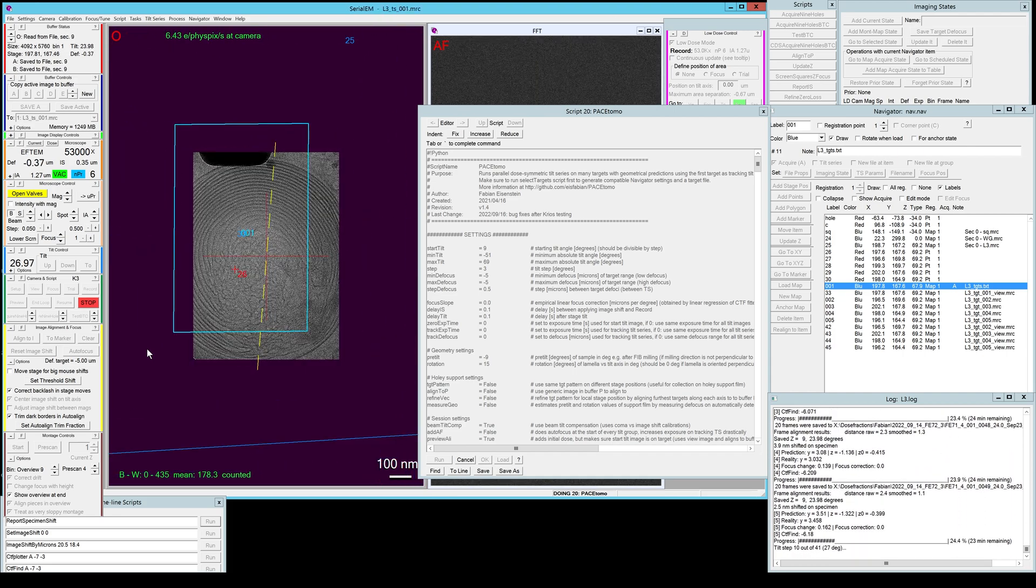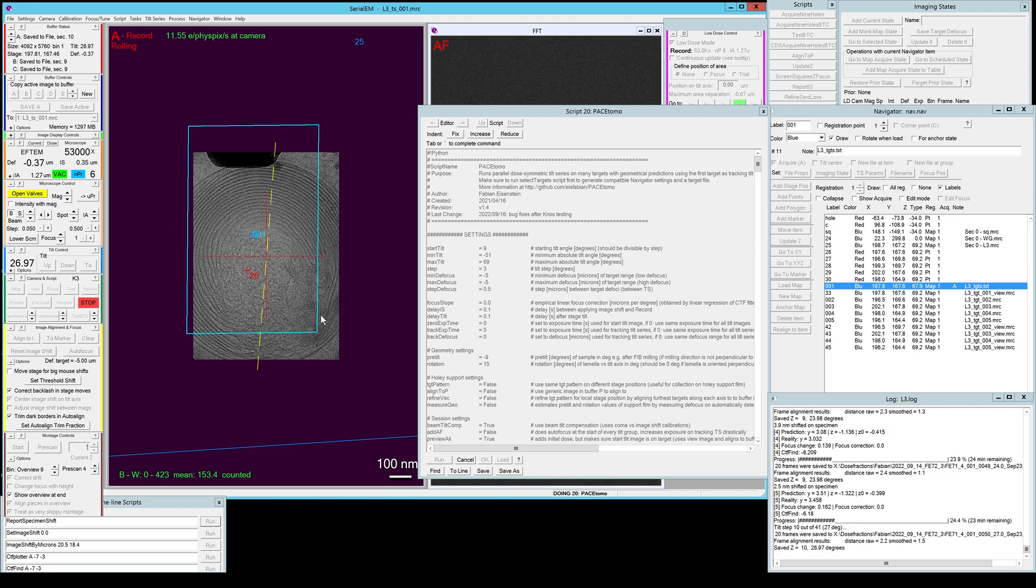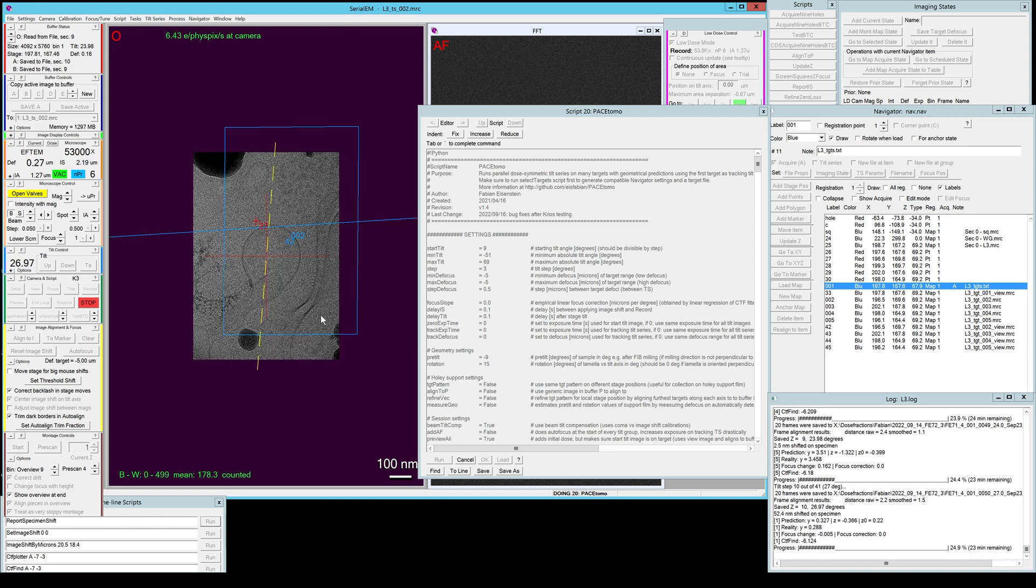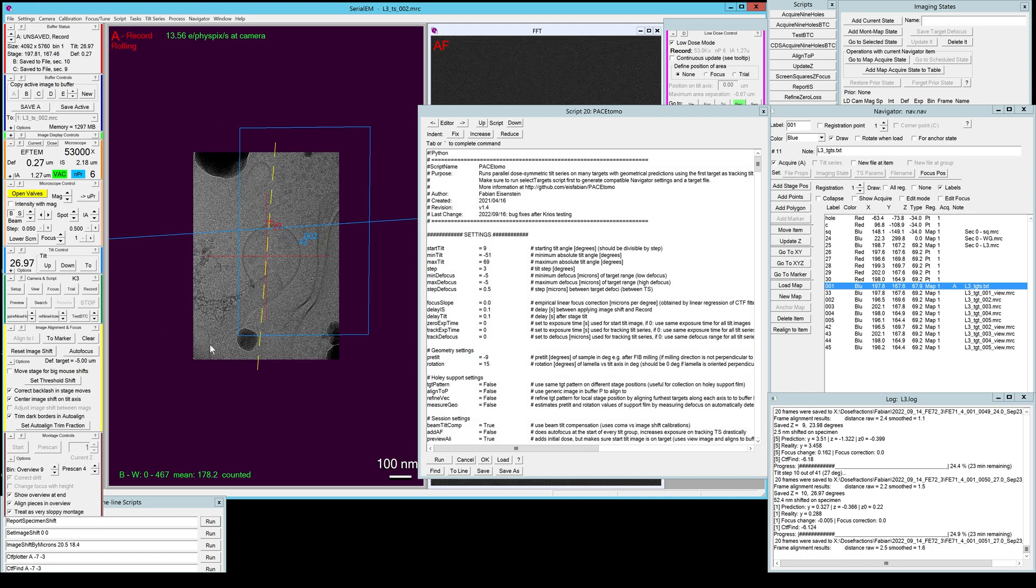It's been running for quite a few tilt angles now. And let's say we found a target that is not very interesting to us or we saw some other issue with the whole collection. What we can do is actually just hit stop and it will stop the script.